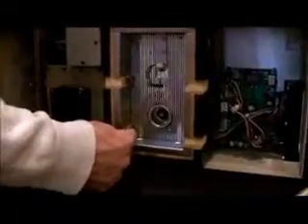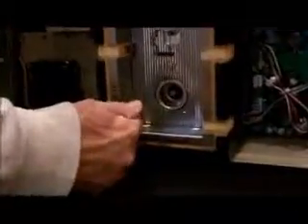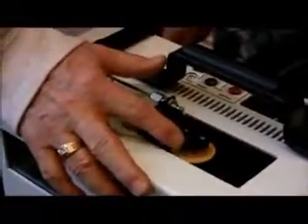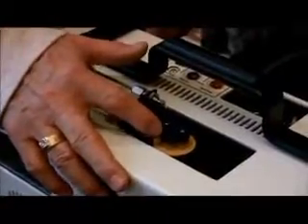And so what one would do for leak checking is to start at the bottom. Of course the carrier gas must be turned on so you can actually have pressures. But starting at the bottom, not at the top. If you start at the top and move down, you won't know where the leak actually is if it happened to be on the bottom. So start at the bottom, check with the leak detector here, here, here, and around these fittings at the sample inlet. And of course, when you get ready to plumb the gases, the leak checking must go on at the utility panel also.